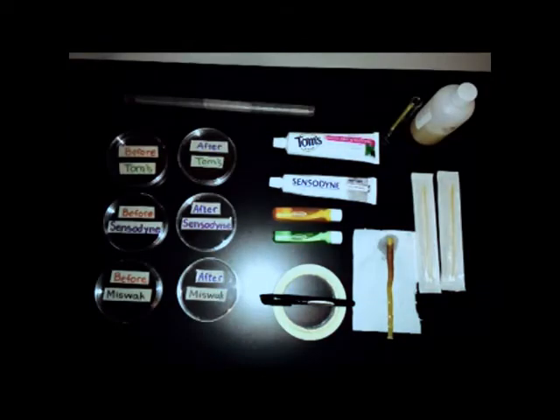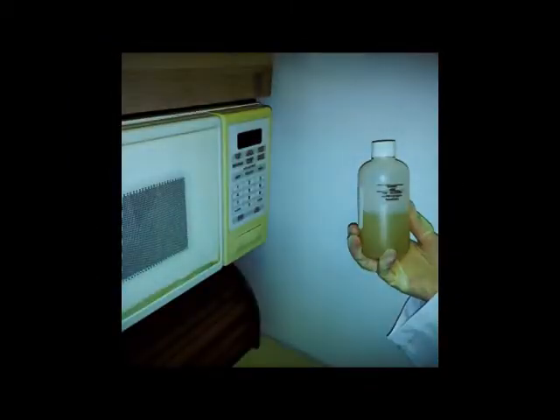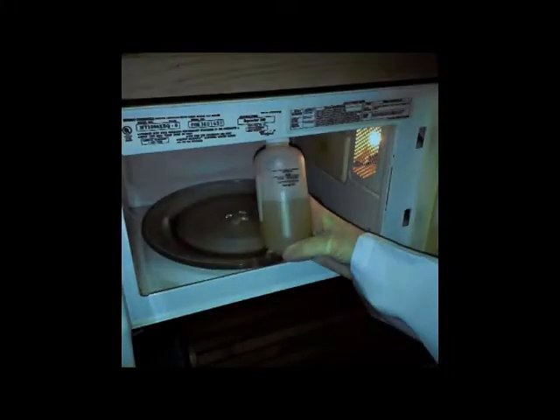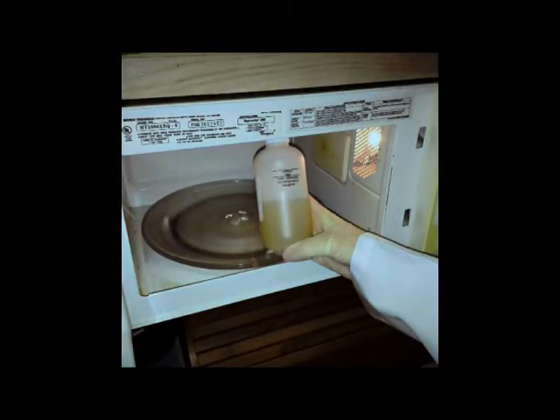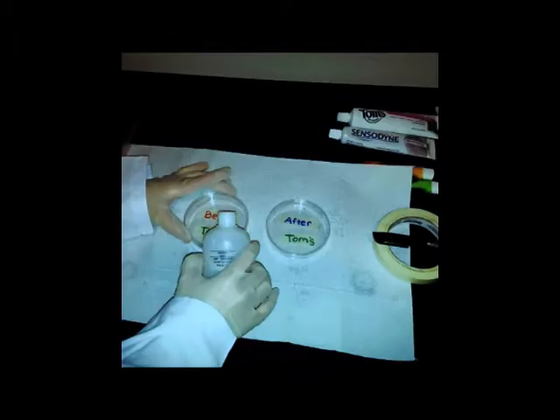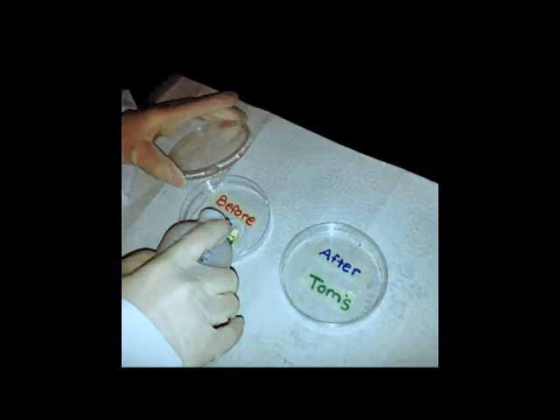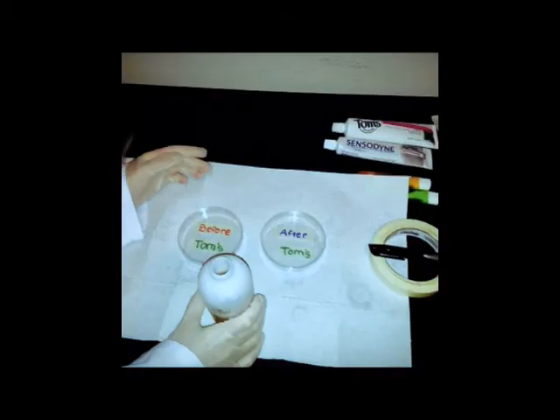First, set your materials on the table. Then get your agar and heat it up in the microwave until it boils. Then pour the agar into the petri dishes as fast as you can. Put your petri dishes in the refrigerator upside down so condensation won't occur.